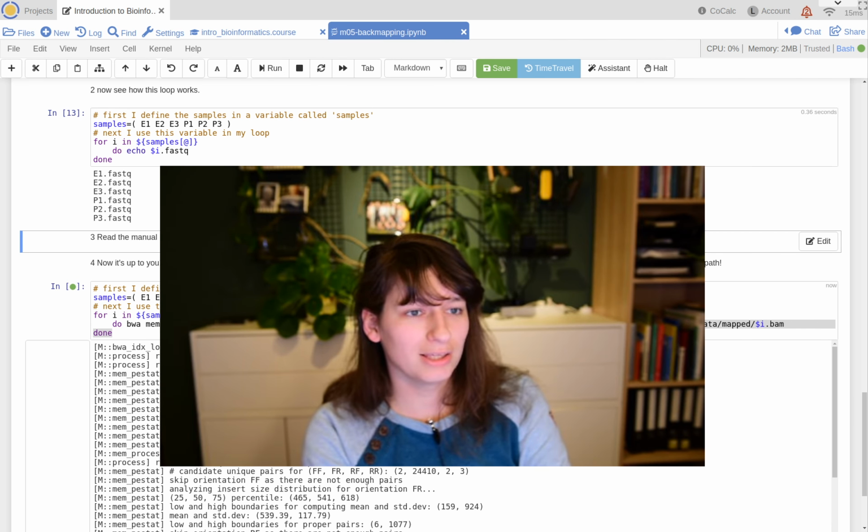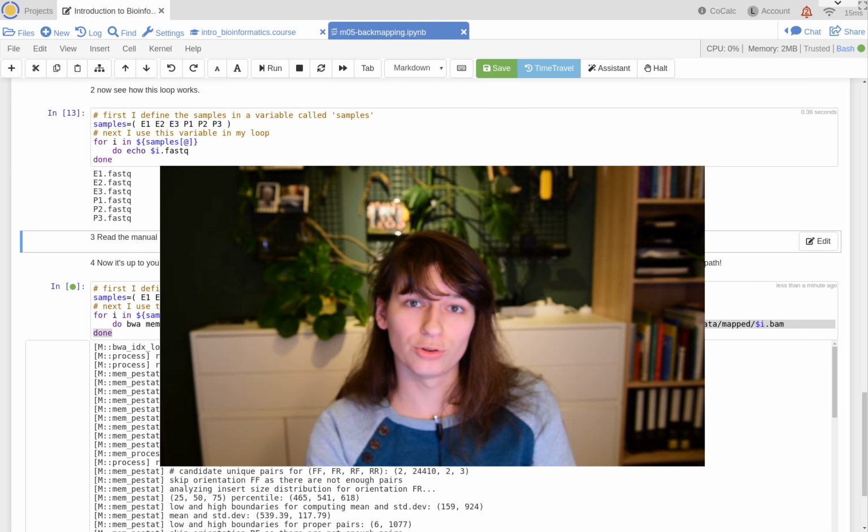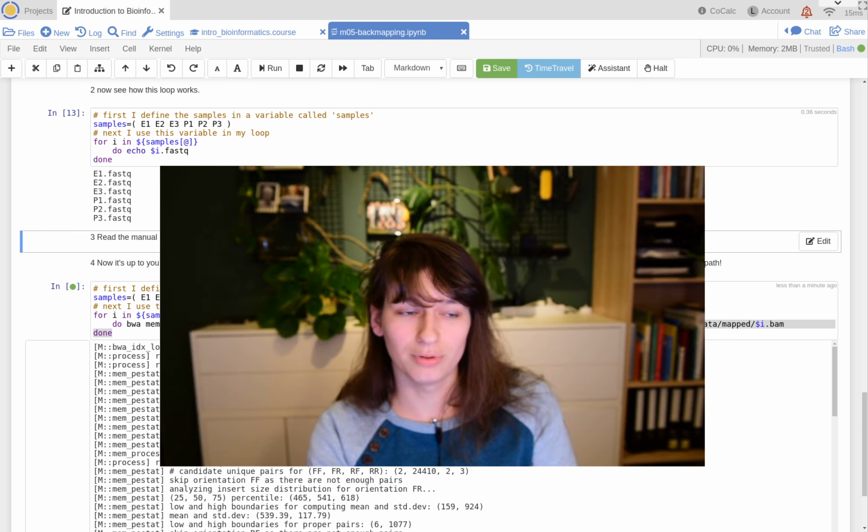These were assembled into a metagenome, basically meaning you take millions of very tiny pieces and make from them thousands of slightly longer pieces. And we now want to know, of all these slightly longer pieces, which I call scaffolds, how much of the original sequencing data actually maps back onto these scaffolds.